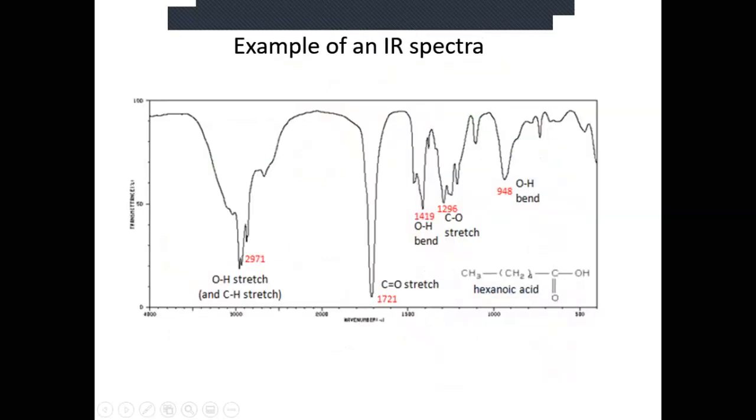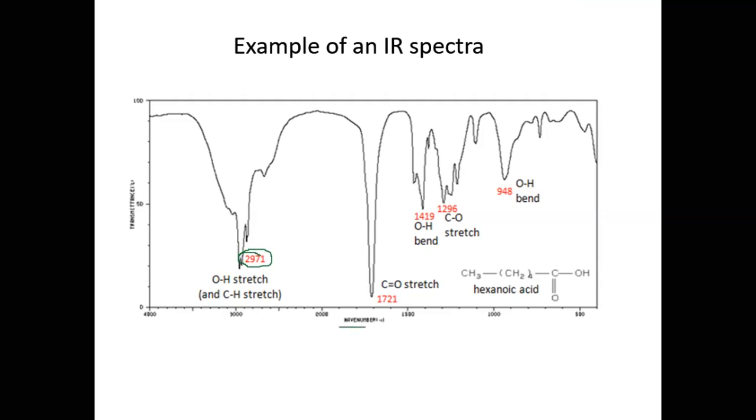So this is an example of an IR spectrum. What you would have done is, once you obtained your product, you go get an IR spectrum and compare it to the IR spectrum of known acetylsalicylic acid and see if the two match up. So for example, here, this frequency at 2971 wave numbers. Again, in IR, we deal with wave numbers. That's the x-axis, which is centimeter inverse.